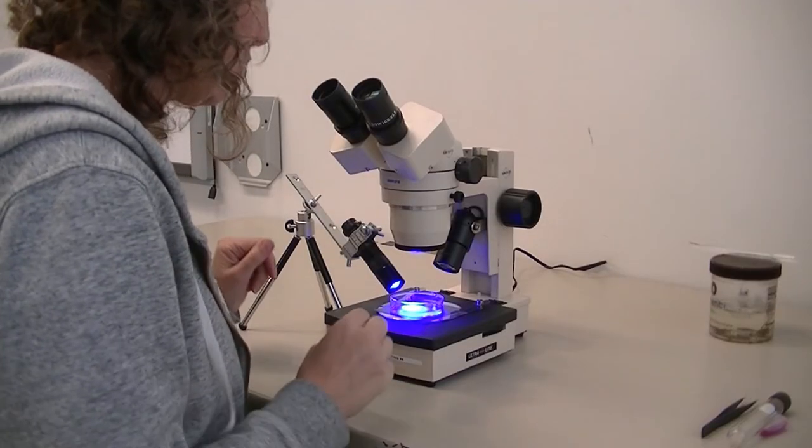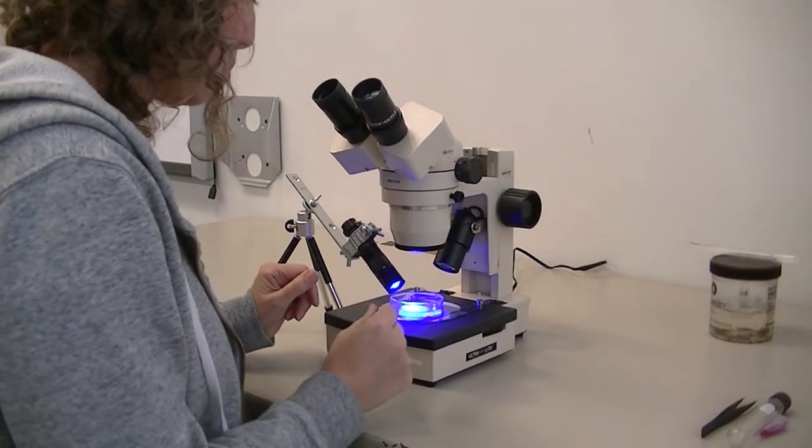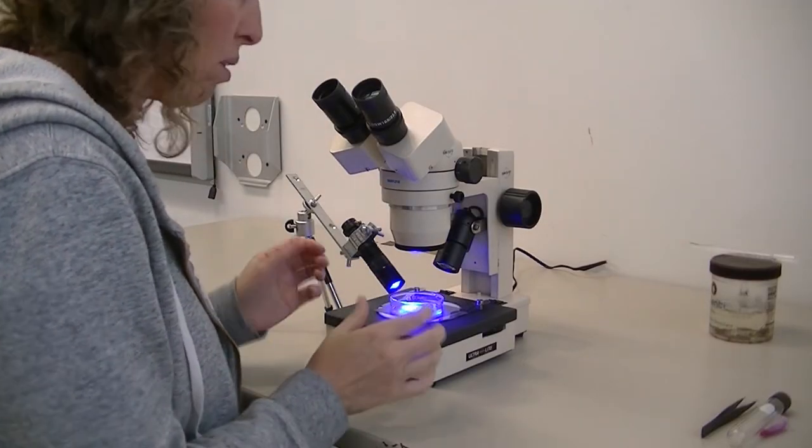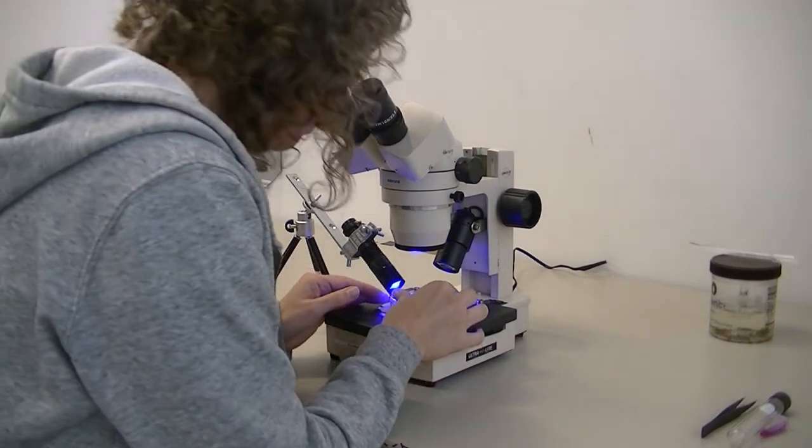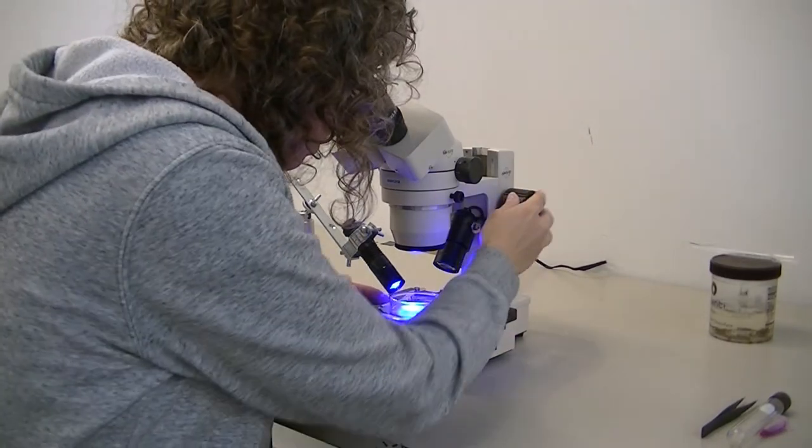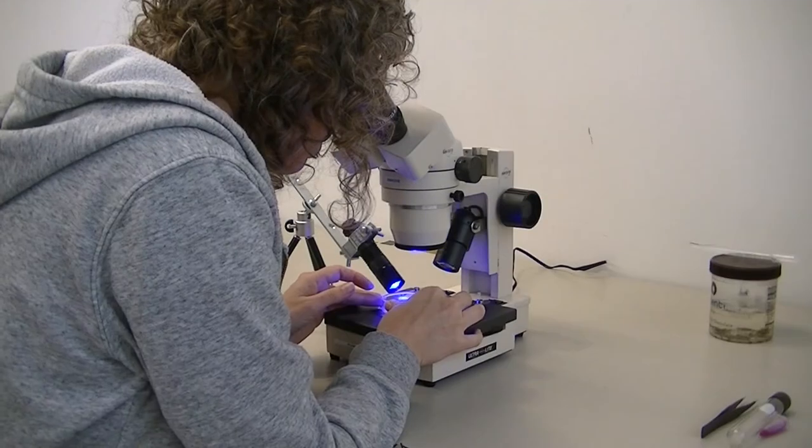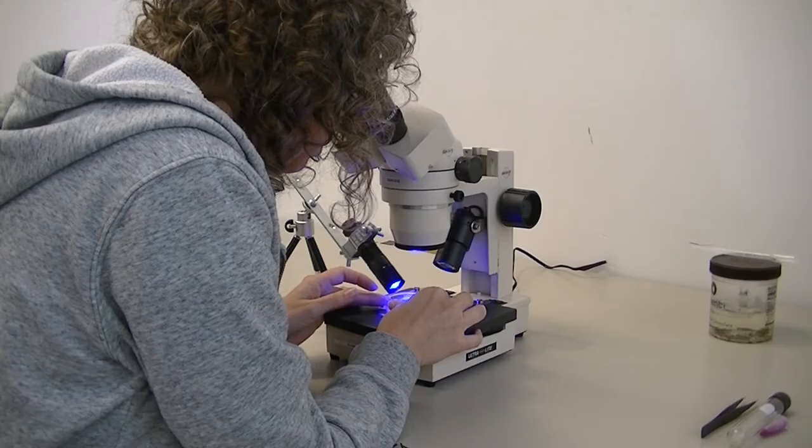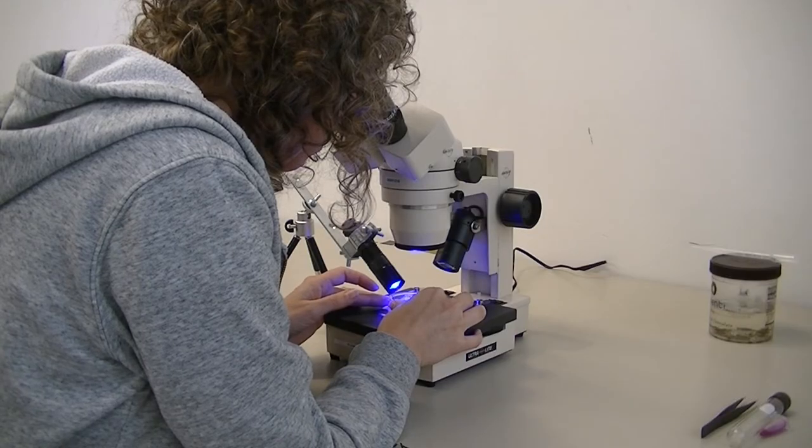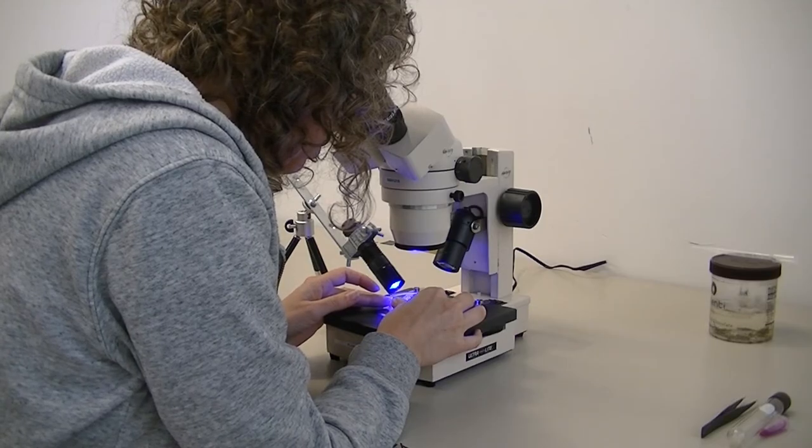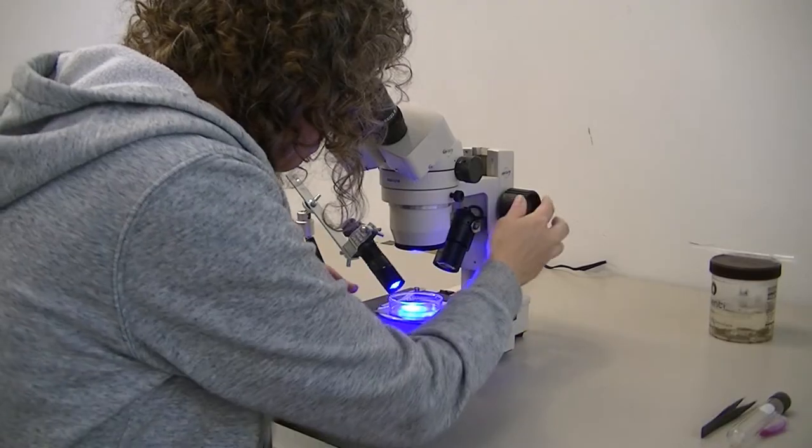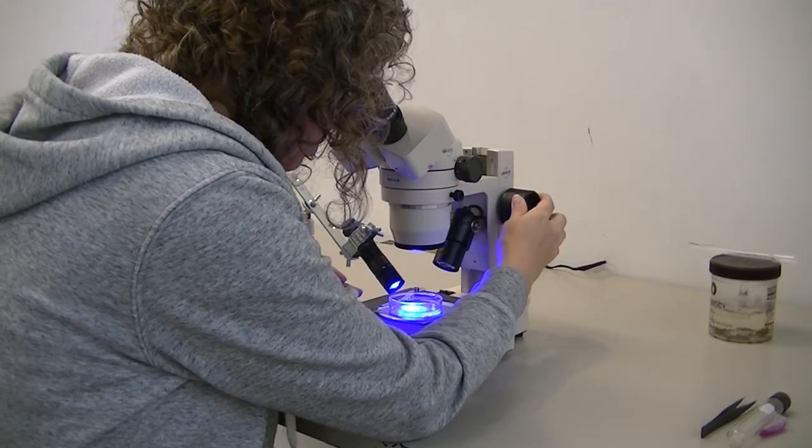You're going to start by examining the sample under fluorescence using the lawnmower technique described in the plankton manual. I've found our control sample, which is nicely red.